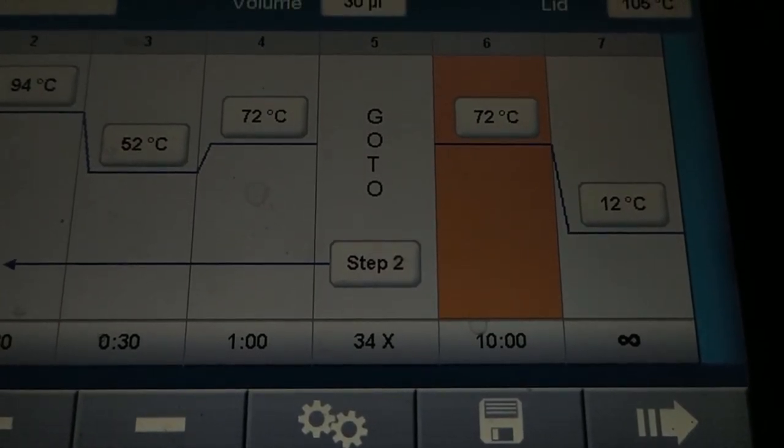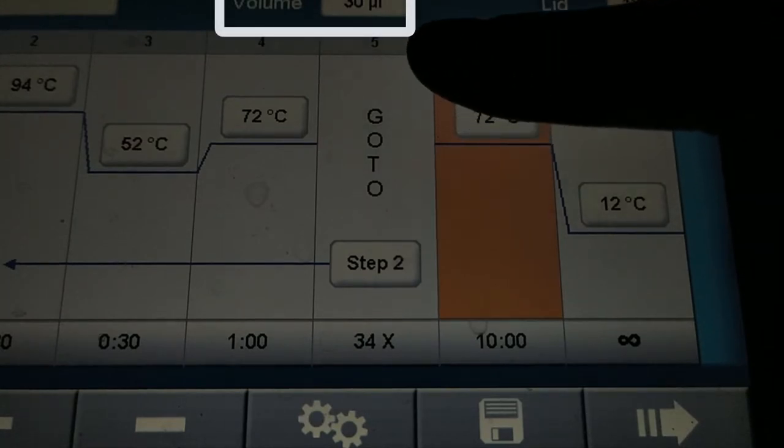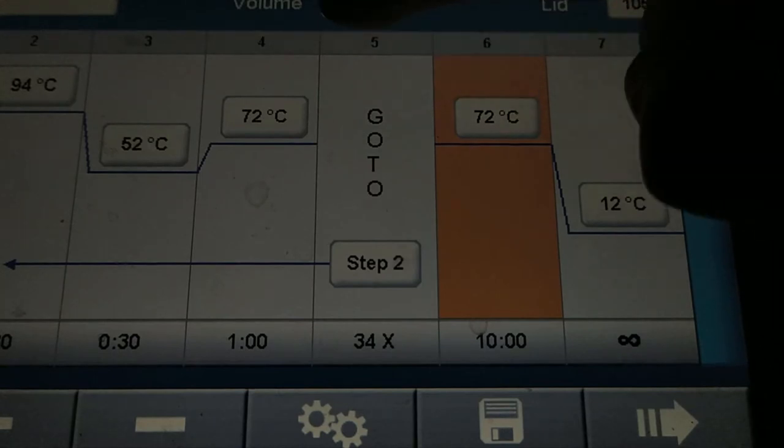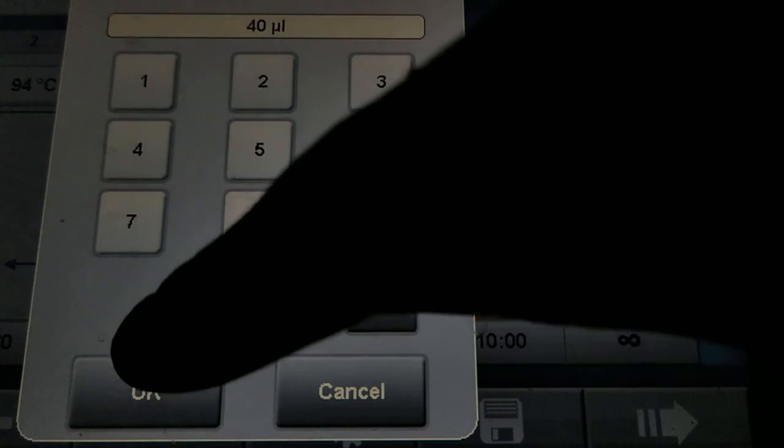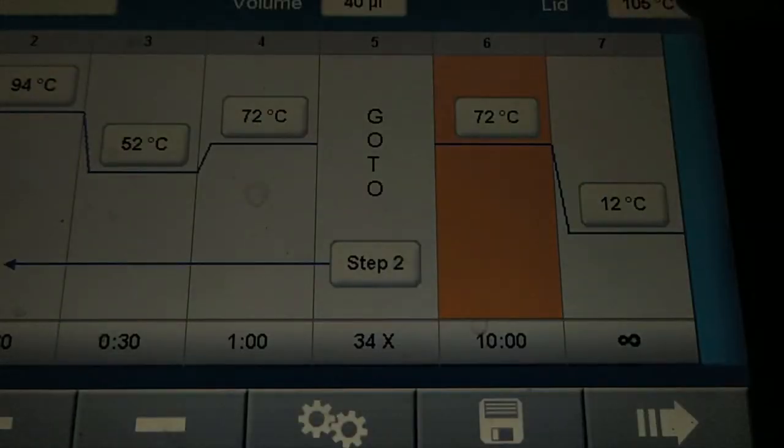Now we need to set the volume of our reaction here so you can find it here. So the volume will be 40. You press on it and set it to 40. And the lid temperature should stay the same so it's 105 Celsius degrees.